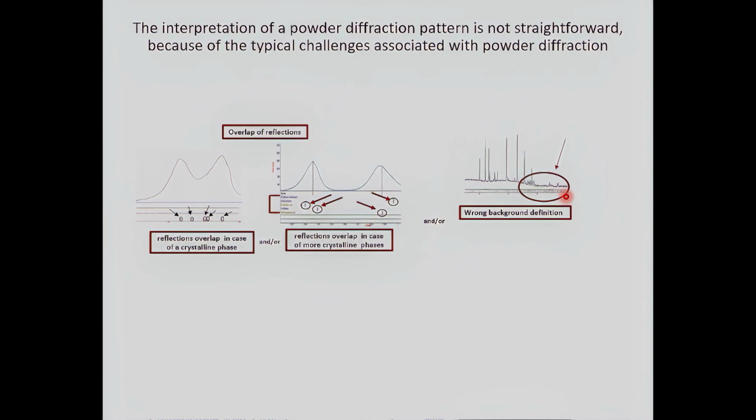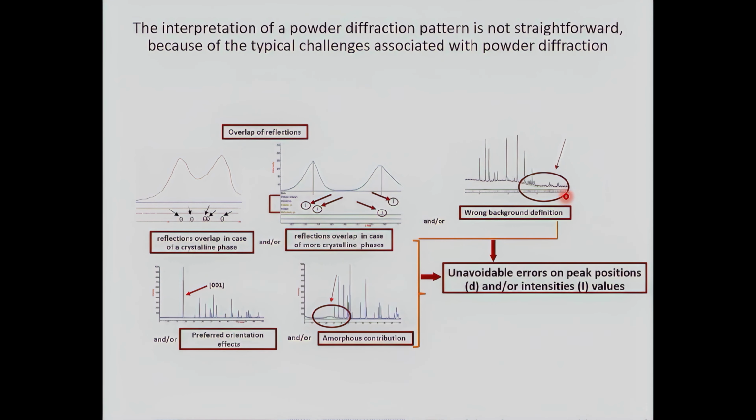Then in the case of powder, it's easy to make mistakes in the correct determination of the background.